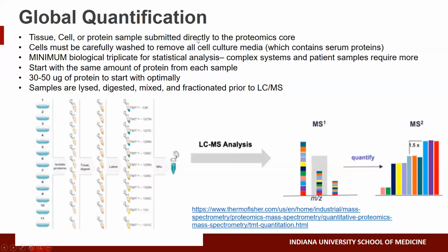So in summary, for global quant, you don't need as much protein, but we do prefer that you have a talk with us, and make sure your cells are carefully washed before submission.